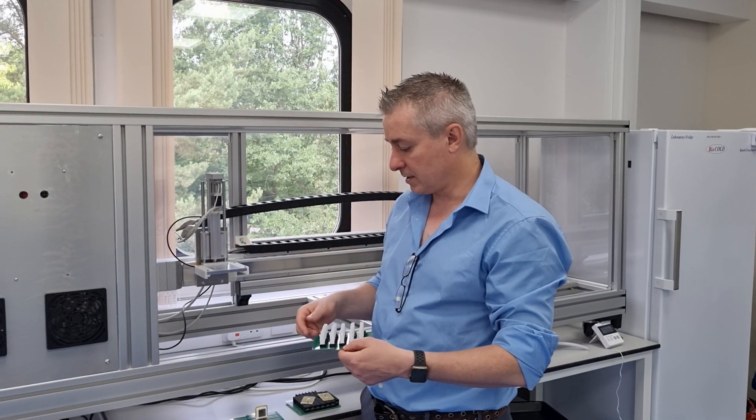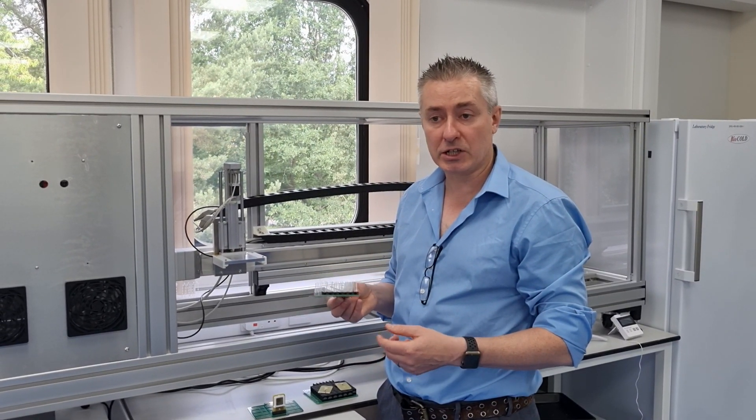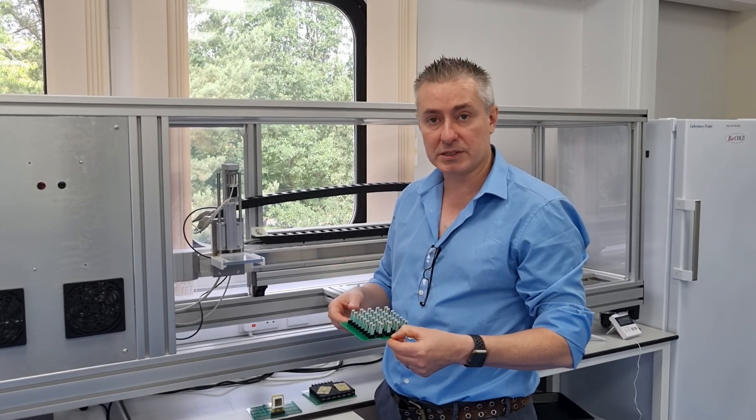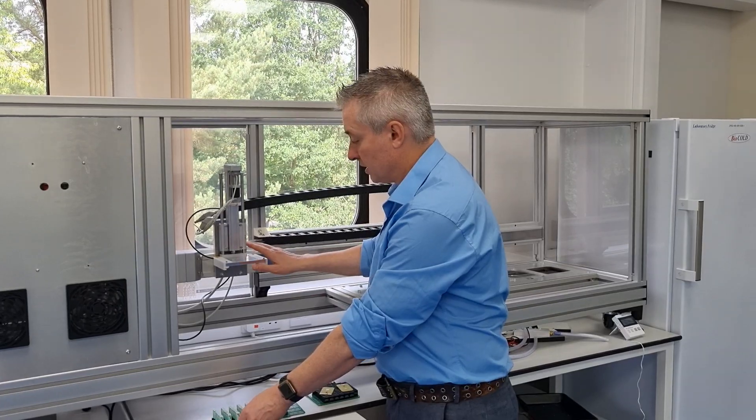In summary, it's an XZ robot for doing modifications of electrodes, and just by switching the PCB we can change the electrodes being addressed by the robot and perform electrochemical modification.